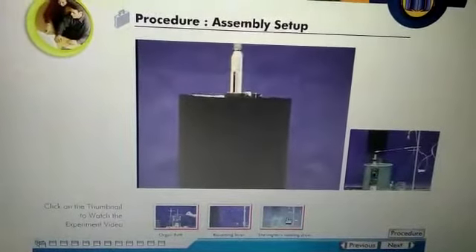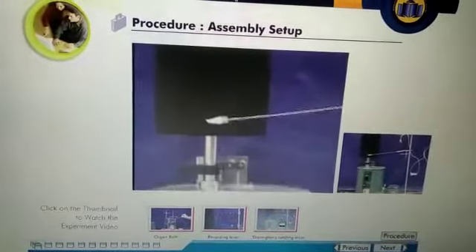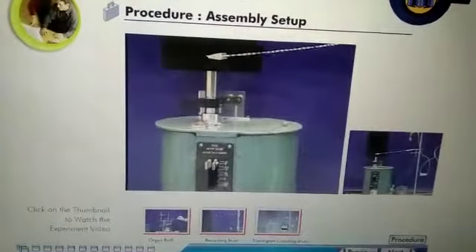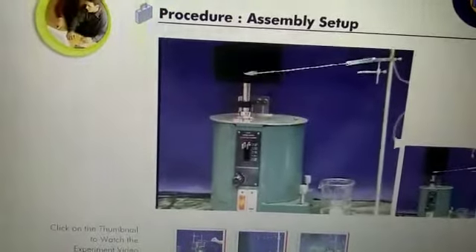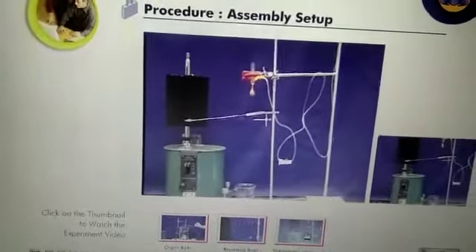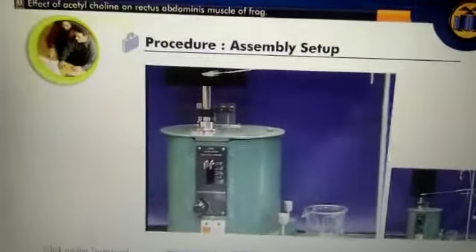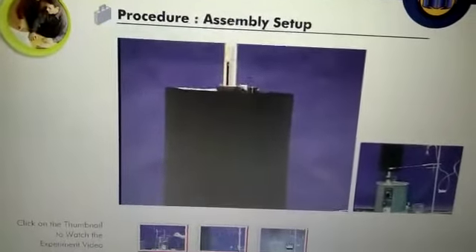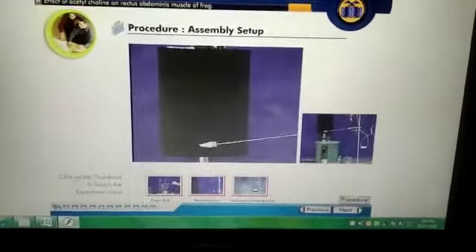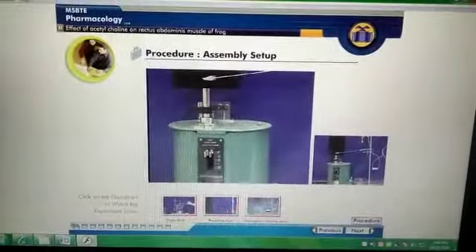Sherrington's rotating drum. It is also known as kymograph. It consists of circular drum, speed regulating gear, shaft to which drum is connected, and main on or off switch. It has clutch lever, screw lift to alter the position of drum, and electrical striker. Kymograph paper is wrapped on circular drum and is smoked with black smoke of kerosene or benzene.